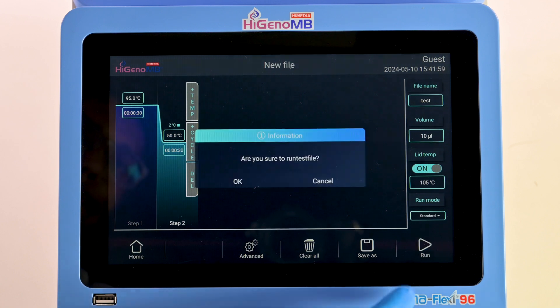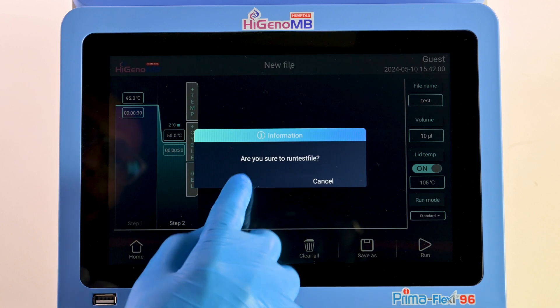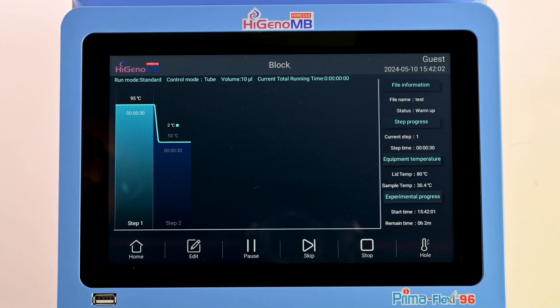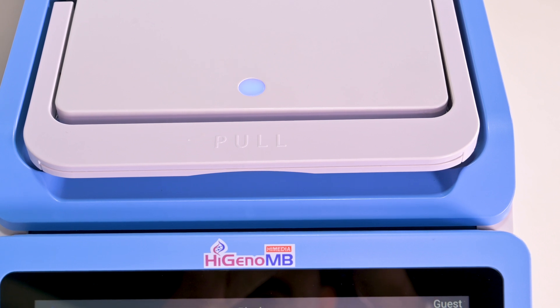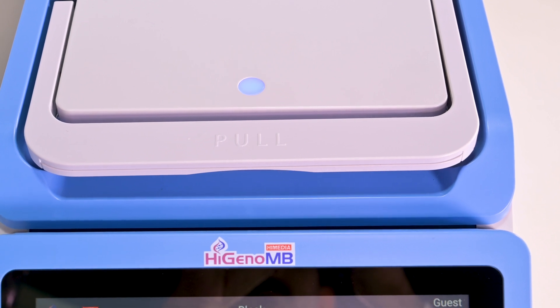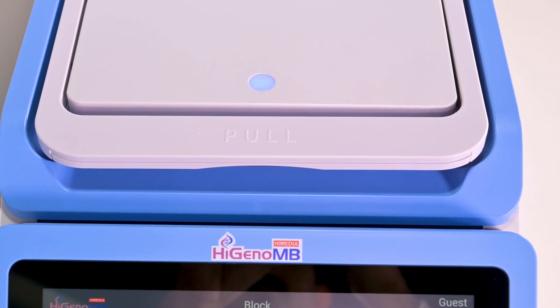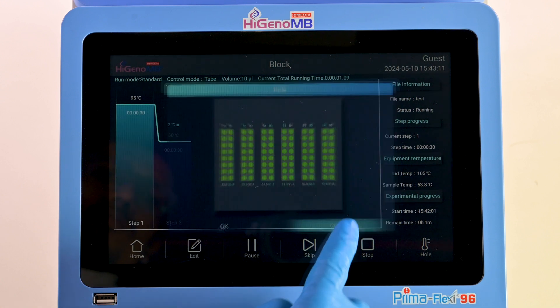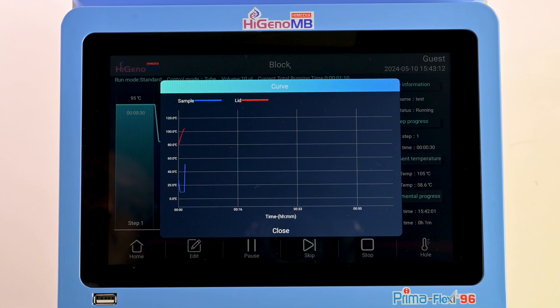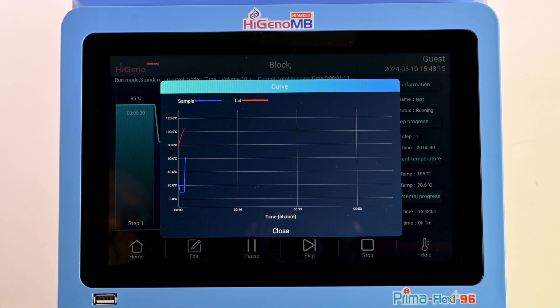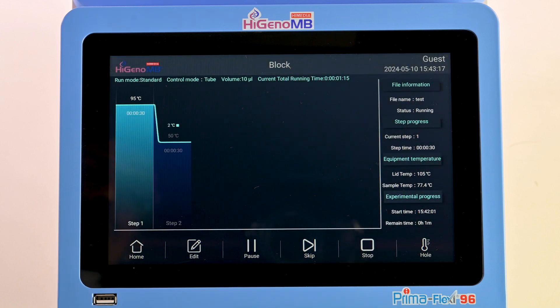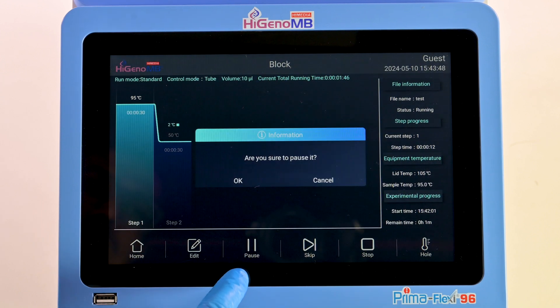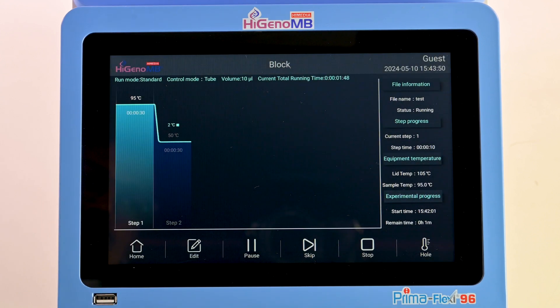Hit Run, then confirm with OK. The blue indicator shows the program is active. For temperature monitoring, click on Hole, then Curve to visualize the temperature graph. To pause the program, click on Pause — you can also edit the program from here.